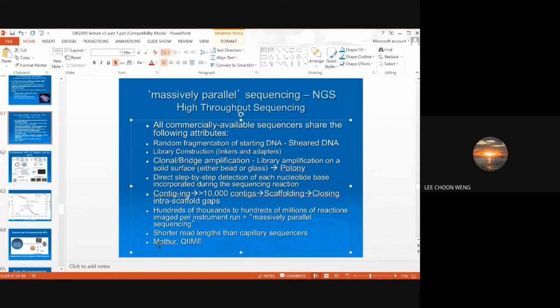The good thing about these two software is that the tutorials are extensive, and there are a lot of pipelines available. They will use the term pipelines a lot. Pipelines give you the processing flow.